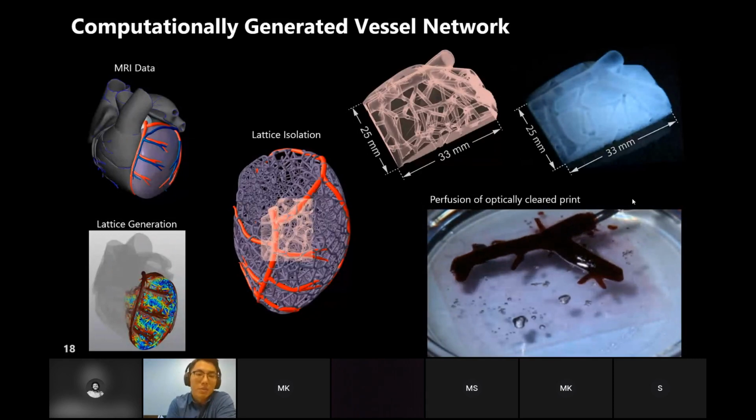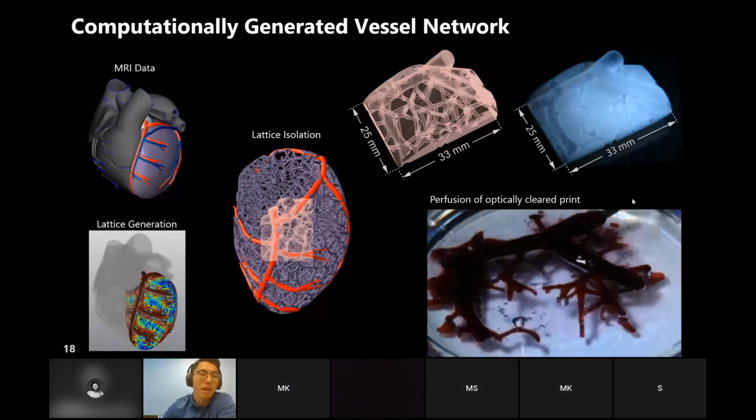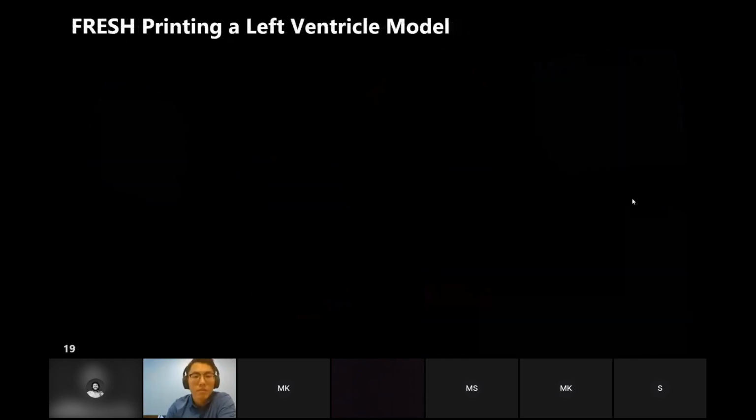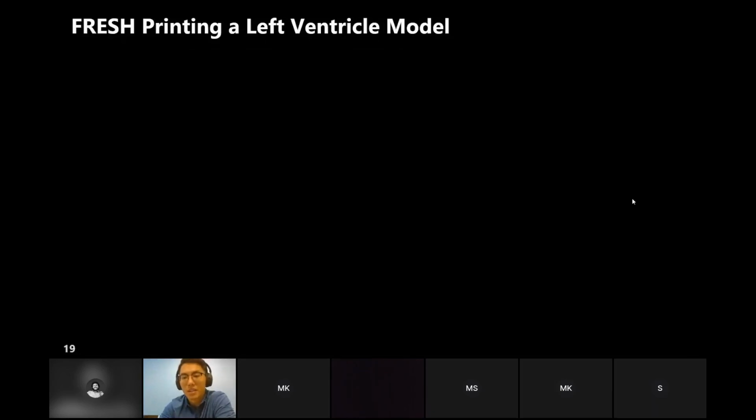And then the next steps with this is how do we start to integrate prints of this scale with tissues that need to be kept alive. And of course, a very key functional component, perhaps the most well-known of the heart, is its contractile activity that allows the heart to pump blood. And this is orchestrated by highly organized heart cells, cardiomyocytes.